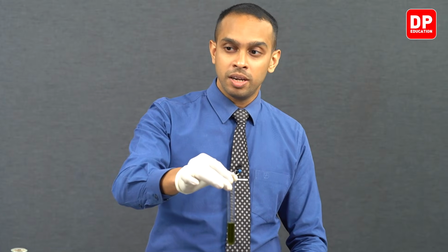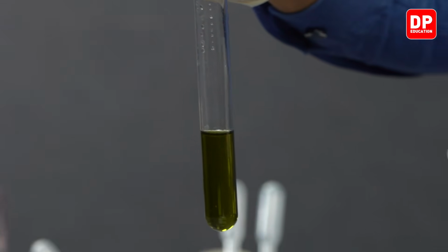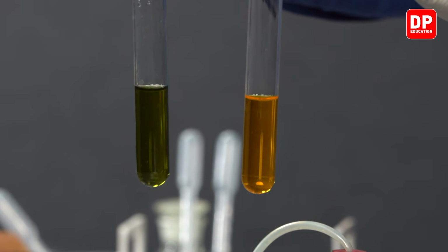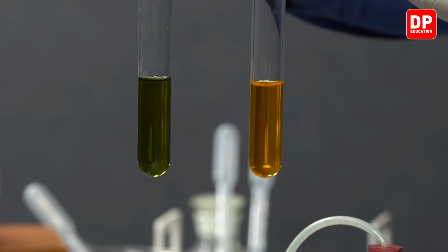Now, students, you can observe that the acidified potassium dichromate solution, earlier it was orange in color, but after we sent sulfur dioxide gas through it, it has now turned to a green color.